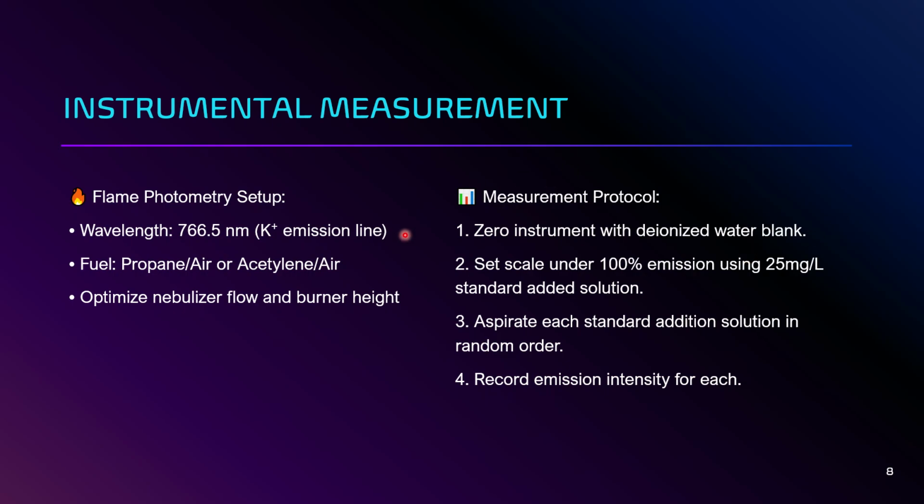It is a similar kind of procedure. For example, when you weigh something on a watch glass, then the watch glass can be set to zero. So the same is there. In spectroscopy, you need to zero your solvent. So if your solvent contains any absorbing species, it is nullified.